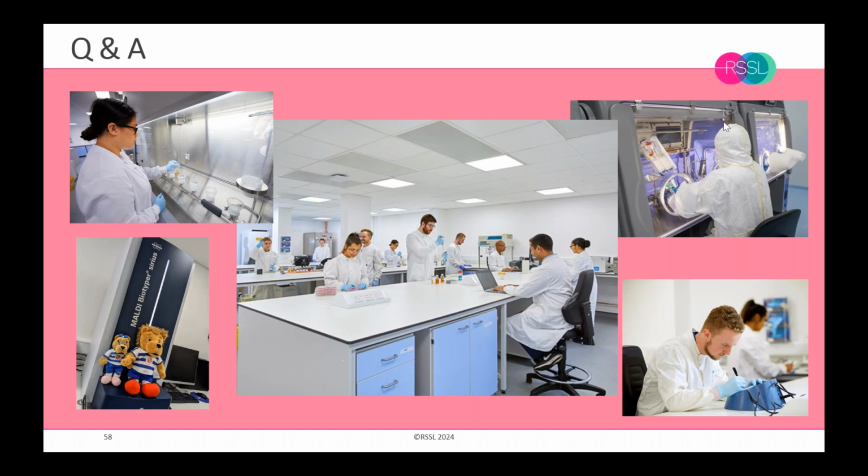I think you need to do both, because the settle plate and the active air, although they're both types of air samples, are seeking to do different things. The active air sample is really important for telling you how many of the particles within that contained space are likely to be microbial carrying. But the settle plate, if it's in the right position, and you've made reference to your smoke studies, will give you an idea of what the rate of deposition is and what's the likelihood of one of those particles actually ending up in your product.